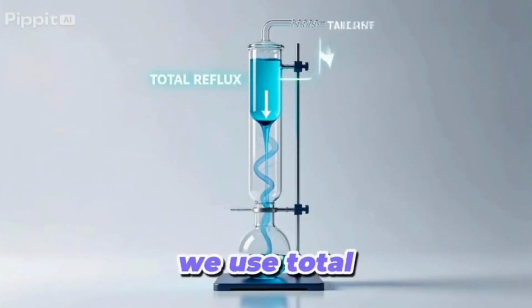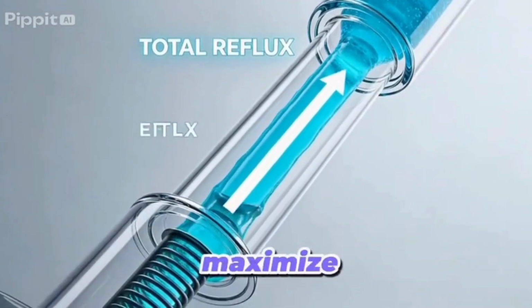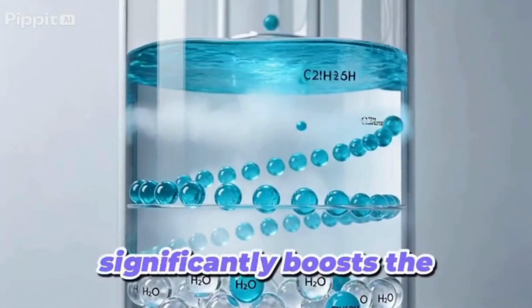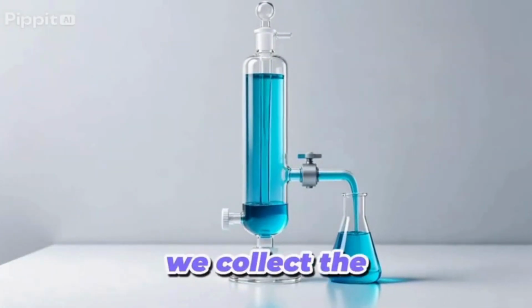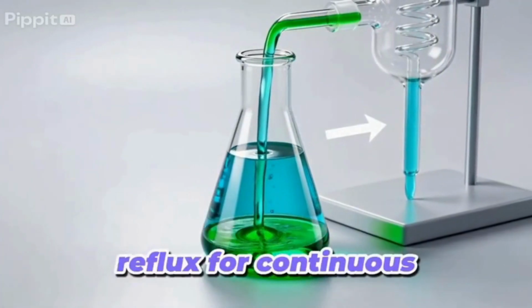Initially, we use total reflux. All condensed vapor returns to the column to maximize efficiency. This crucial stage significantly boosts the ethanol concentration at the top, ensuring high purity. Once stable, we collect the high-purity distillate while maintaining optimal reflux for continuous quality.